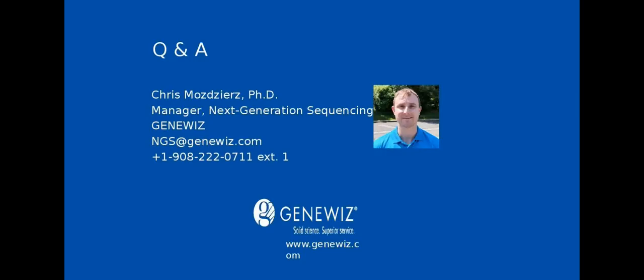One more question would be, I have a de novo genome assembly, and I've used short read technology, but I have a lot of gaps in the assembly. Can I use PacBio long amplicon sequencing to plug those gaps? With PacBio, there are two ways that you can improve that assembly. You can use PacBio as a shotgun genome sequencing approach and do more of a hybrid type of assembly using short read and long read chemistries.